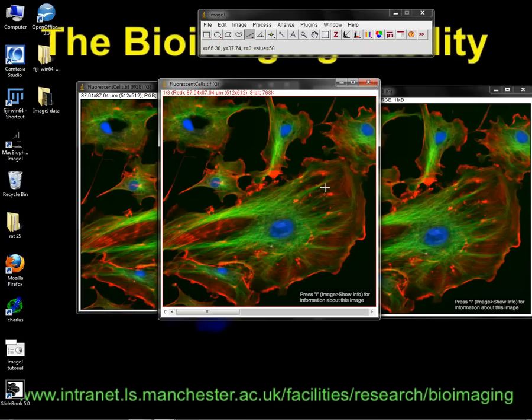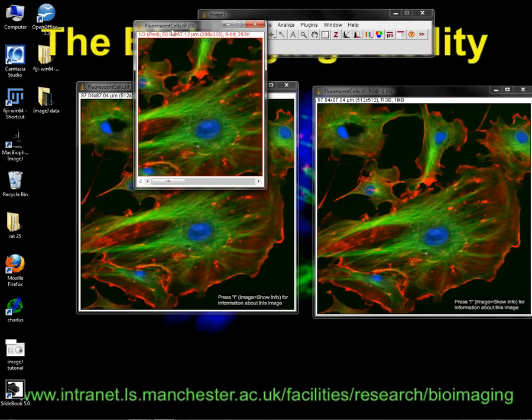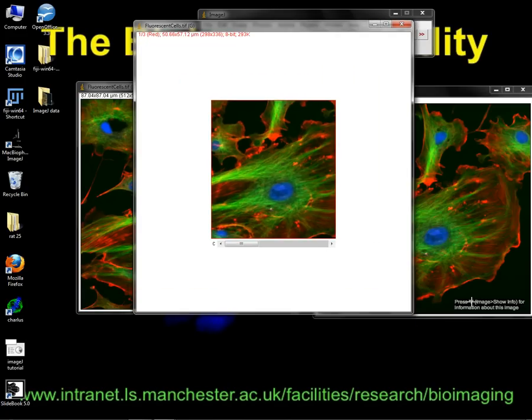I think when I have big images open and then they try to crop them to a certain size, 300 pixels, 500 pixels, if I apply the set scale tool, it won't be in pixels anymore, and it's difficult later. Right. Because if you crop that image, you're not really changing the pixel calibration, you're just making fewer of them. So now you've got a smaller area, but the pixel calibration is still the same. So that's how you can crop that easy.